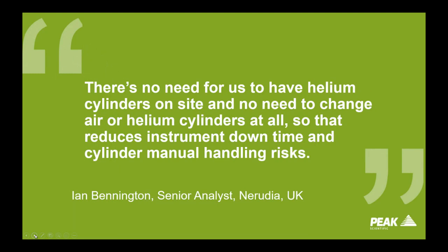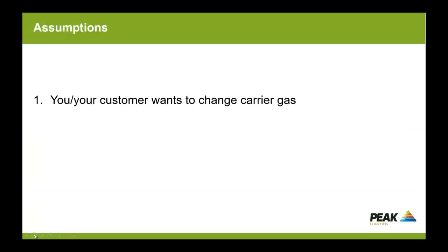We have worked with a number of customers who have successfully made the change from helium to hydrogen. Key benefits being seen again in being able to move away from cylinder supply. There are other potential benefits with moving to hydrogen, such as higher throughput of samples. But we do make a number of assumptions if you are looking to move to hydrogen carrier gas, or if you have customers who are moving to hydrogen carrier gas.